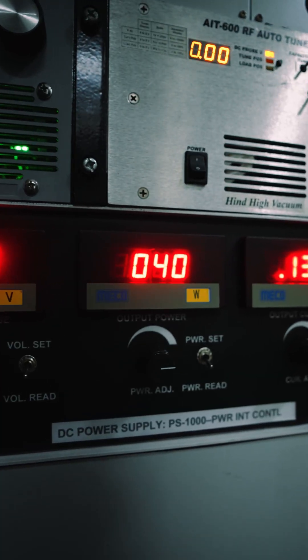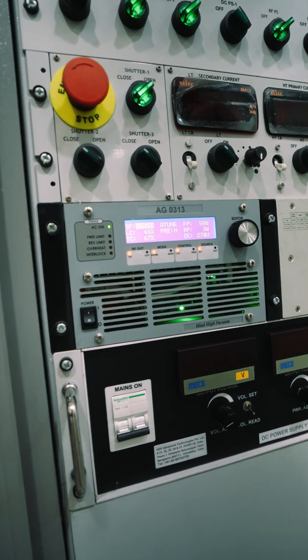The system is equipped with a dual-pocket magnetron enabling sequential, multi-layer deposition of different materials without breaking vacuum, essential for fabricating complex thin film structures.